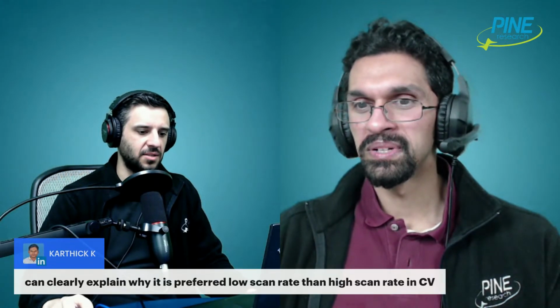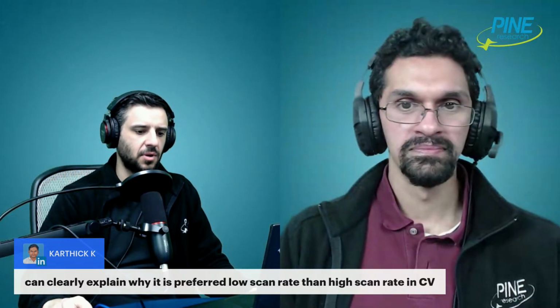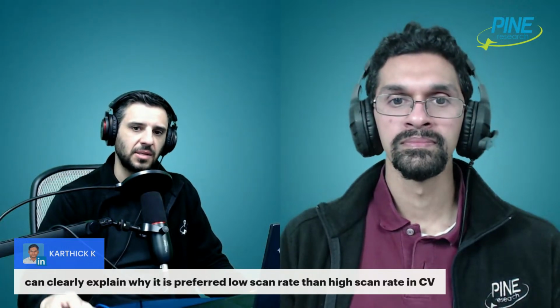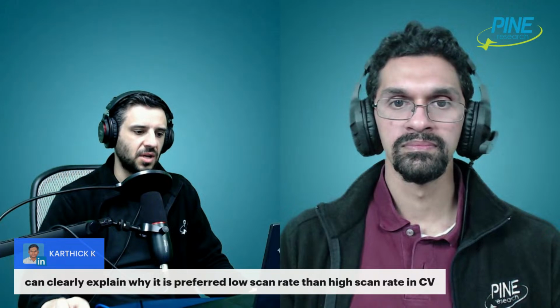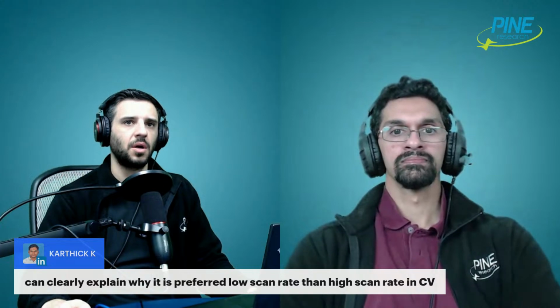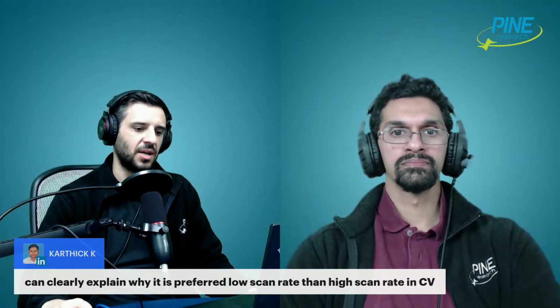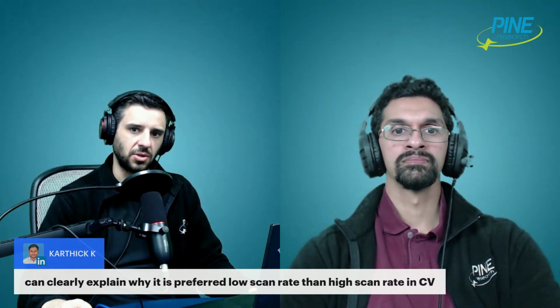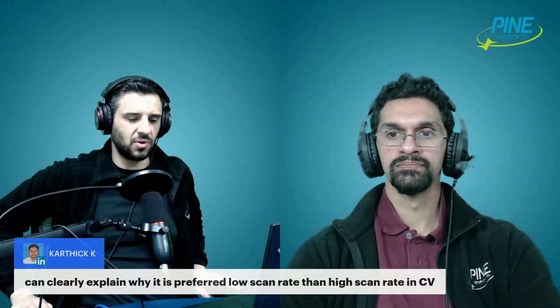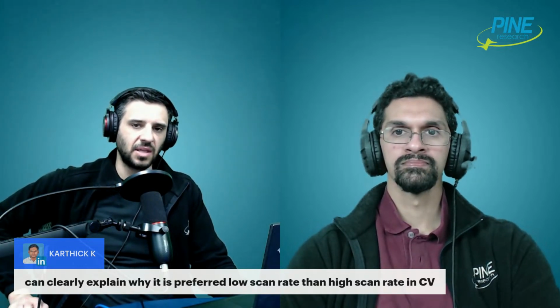All right, and then Karthik has another question from LinkedIn. He says, can you explain why it's preferred to use a low scan rate rather than a high scan rate in CV? It isn't, but it depends on the application and what you're studying. There isn't really a general preference or recommendation as a general rule in electrochemistry to necessarily use a slower scan rate. It's not always the case. So just to be clear, with respect to the system that you're studying, you might have that be the case.